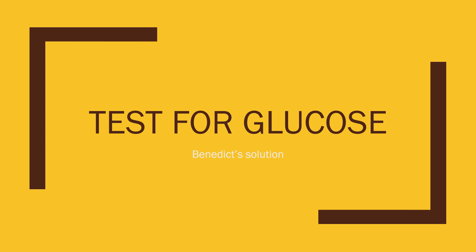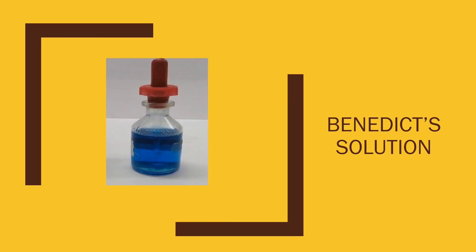This is a test for glucose or reducing sugar. Our test reagent is Benedict's solution. This is the Benedict's solution. Its color is blue.